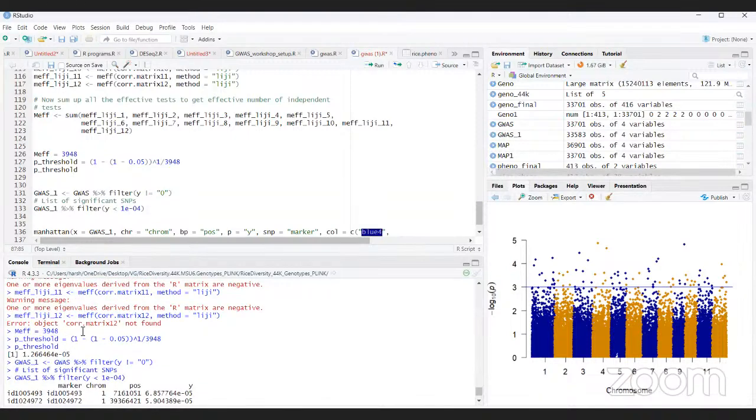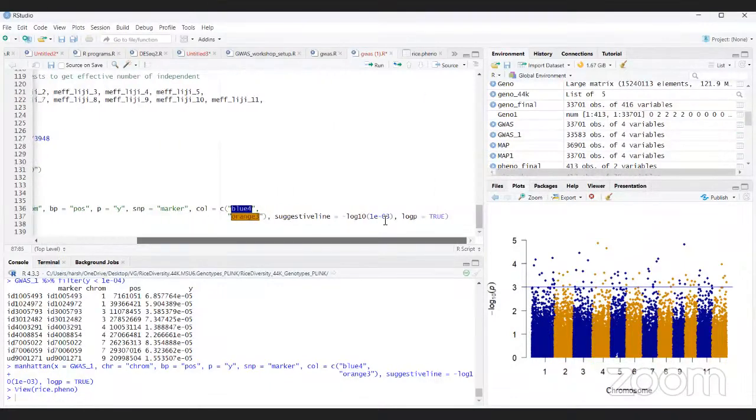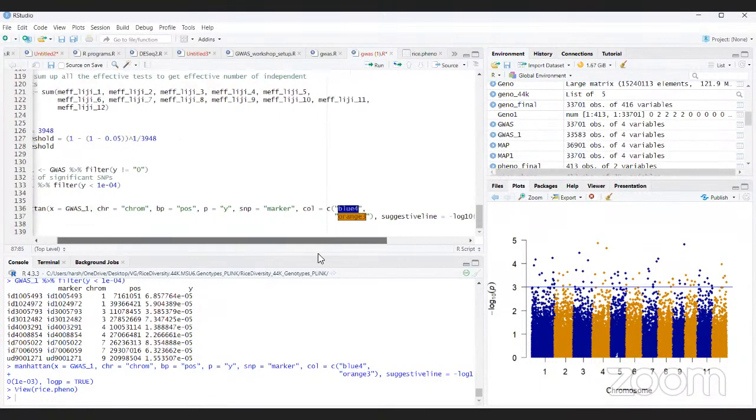Yeah. So we can set the threshold, and then we'll try to get our filter. We'll filter the new file that is being created with our filter for SNPs to identify the SNPs. And in the analysis part, in the visualization part, we are trying to set the threshold based on the data. We can vary the threshold, that is, you can change the threshold that you want to set.